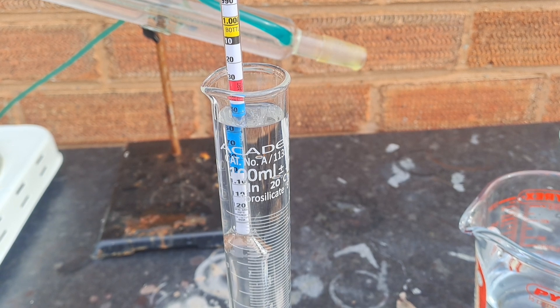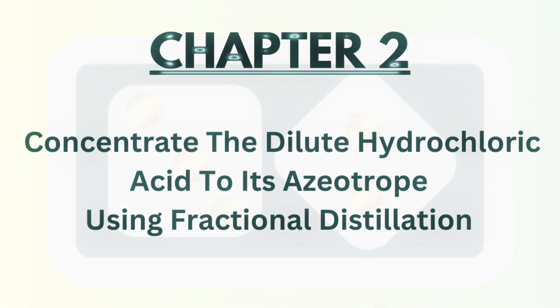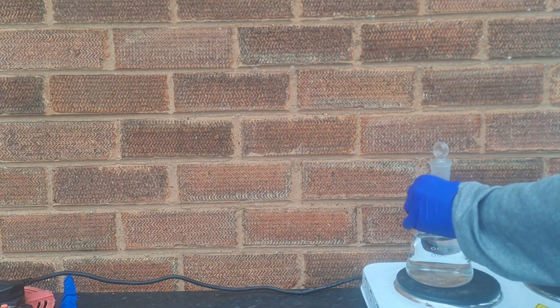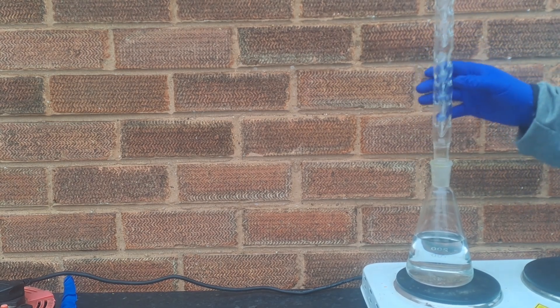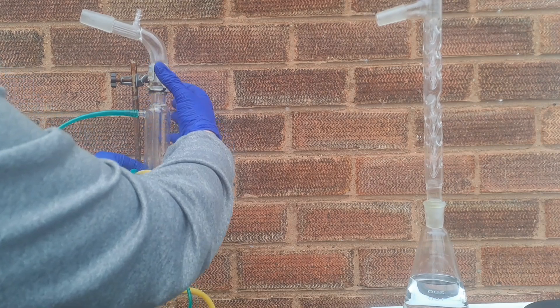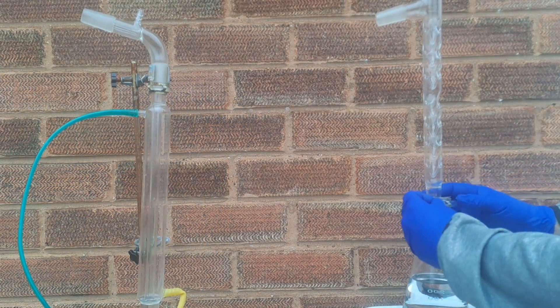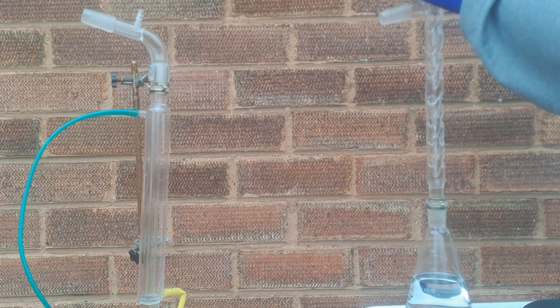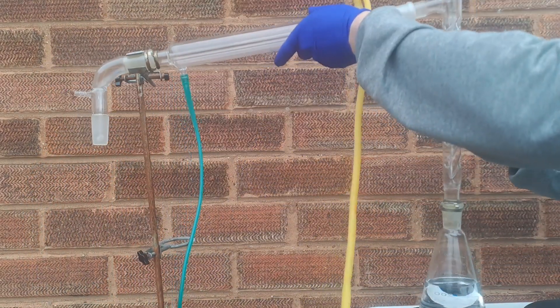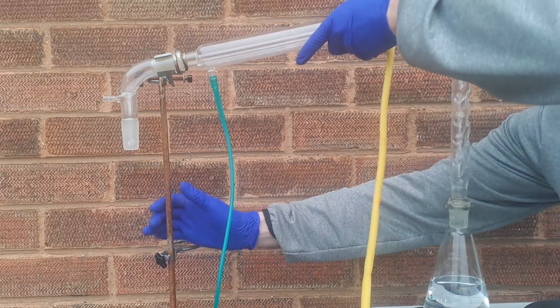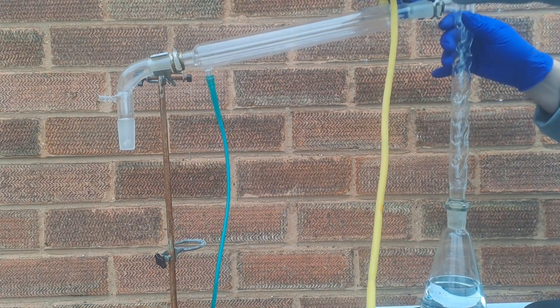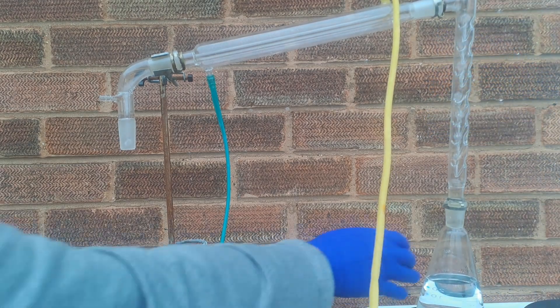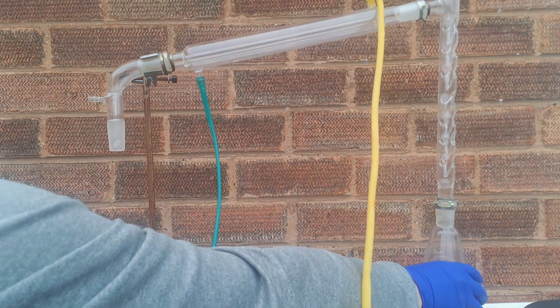Now we know the concentration of the acid, it's time to remove as much of the water as possible using fractional distillation. 11% hydrochloric acid does have its uses — it is great for cleaning glassware, especially inside conical flasks and round bottom flasks, or anywhere you can't get a scrubbing utensil. So even if you are able to buy concentrated hydrochloric acid, it might be worth doing this and keeping the acid for cleaning. However, I want concentrated hydrochloric acid, so the next step for me is to remove the excess water from the acid and bring it to its azeotrope of 20.2%. For this, I need to set up for fractional distillation.